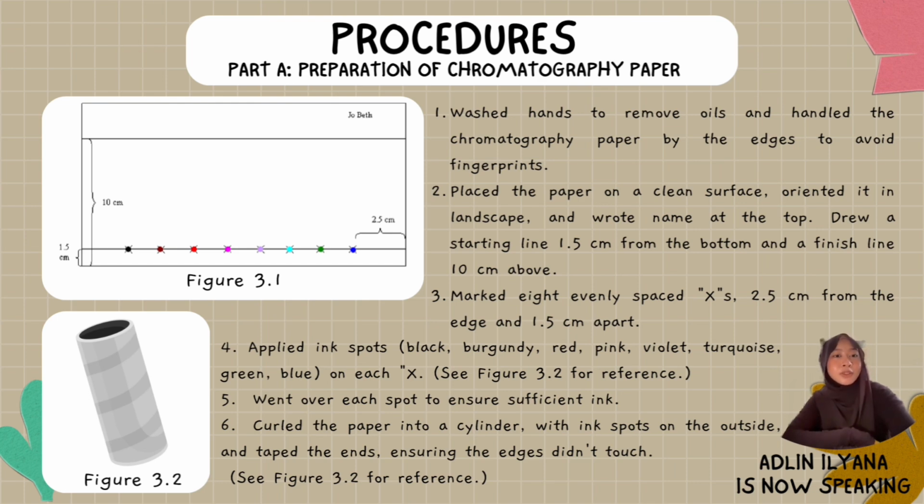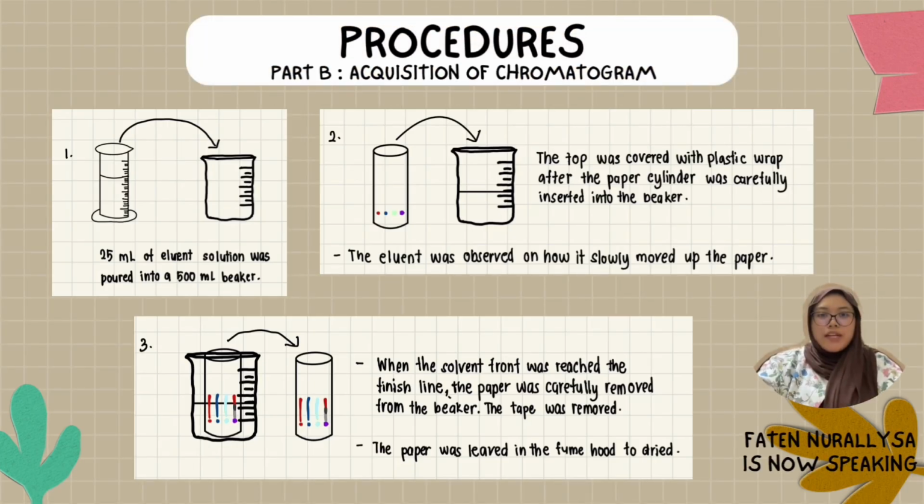At this point, the chromatography paper is prepared, resembling the setup shown in figure 3. This preparation step is essential before proceeding with the actual chromatography process. I will now explain the process of acquiring the chromatogram.